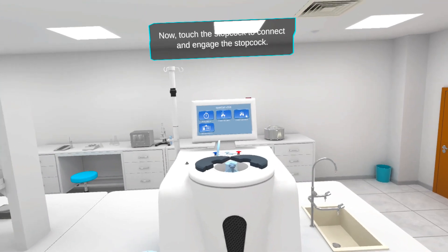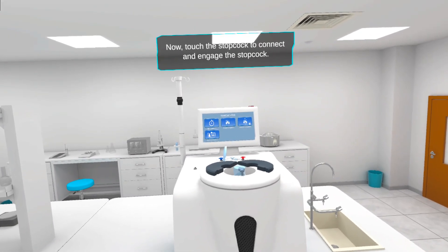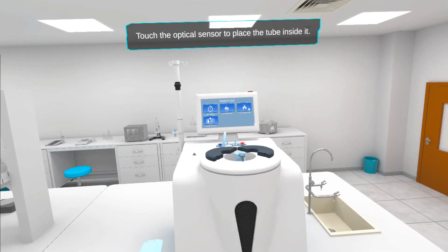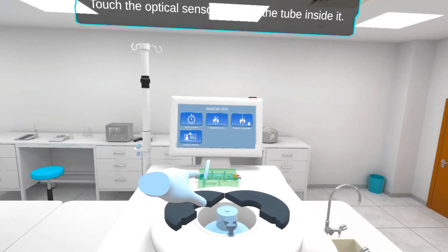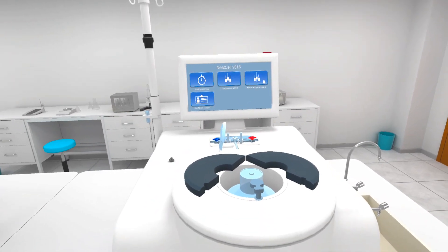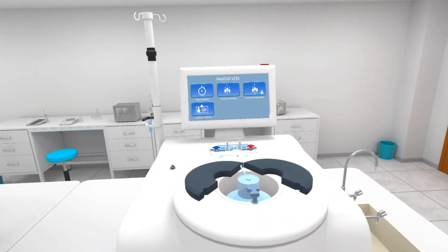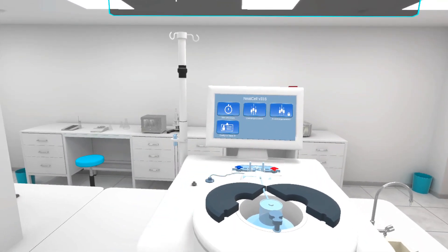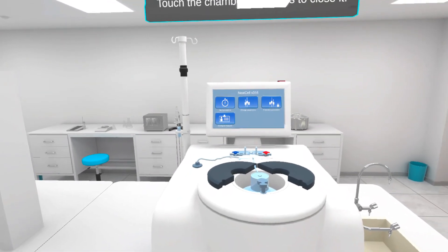Now, touch the stopcock to connect and engage the stopcock. Touch the optical sensor to place the tube inside it. Touch the pressure sensor to screw the connect filter. Touch the chamber pit covers to close it.